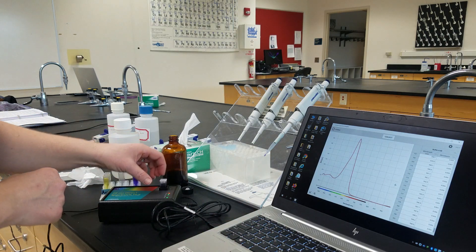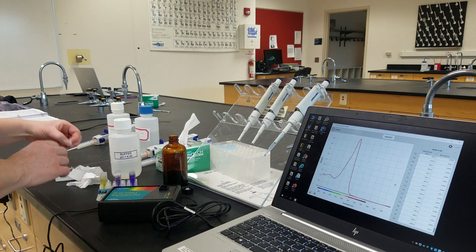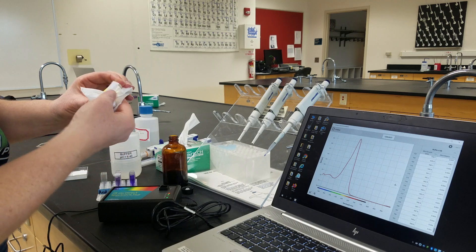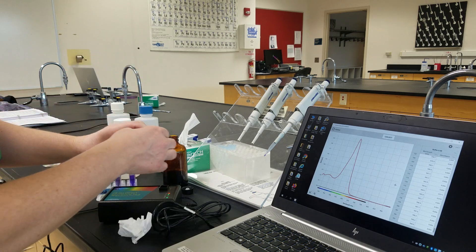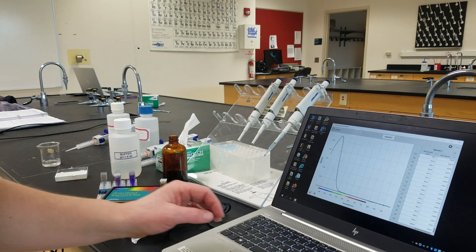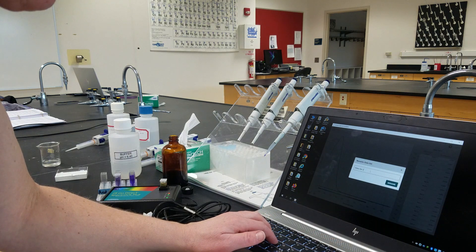We're going to do the same thing with our acid solution. I'm going to mix it up well, make sure there are no fingerprints, and place our solution into the light source. I click Collect and Stop, and rename this one Acid.